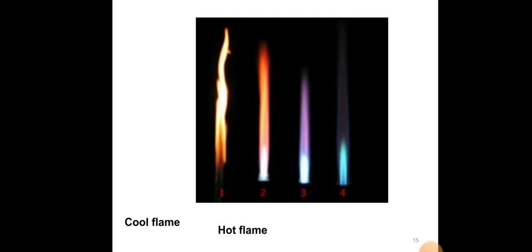Here you can see the picture of 4 different flames. On the left side, we have a cool flame with less air and more fuel.